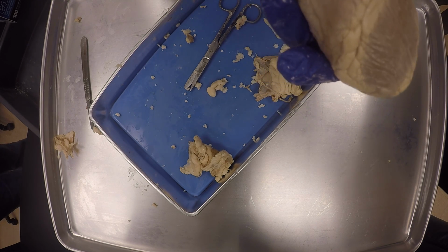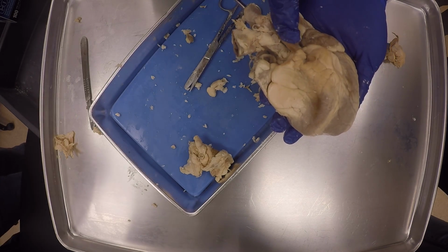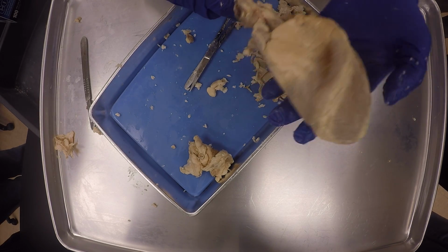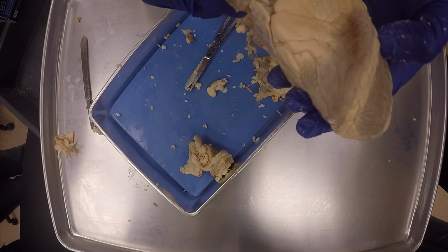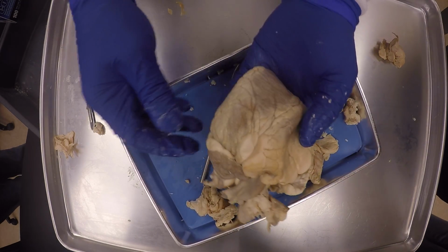Do you see how I put this and it went to the right side? Because that's the pulmonary trunk. And then I put it in the aorta, it's coming from the left ventricle, so it's going to go here. If you could feel my dowel here, it's right there. Do you see how it's stabbing in there? Okay. Excellent. I hope I was in frame.